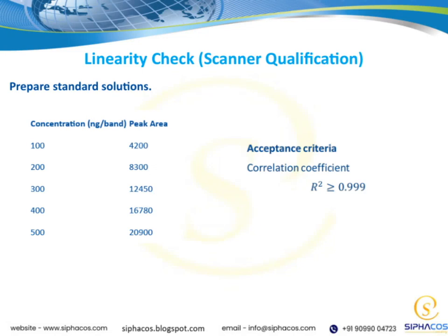Let's move on to preparing standard solutions, which is a crucial step in ensuring accuracy in our analysis. When we prepare these solutions, we're essentially creating a baseline or reference point for our measurements. This helps us verify that our equipment is functioning correctly and that our results are reliable.